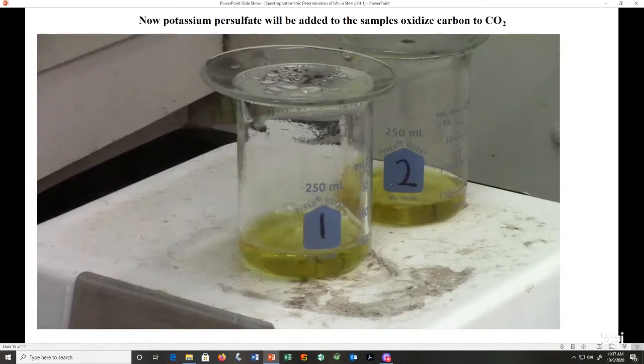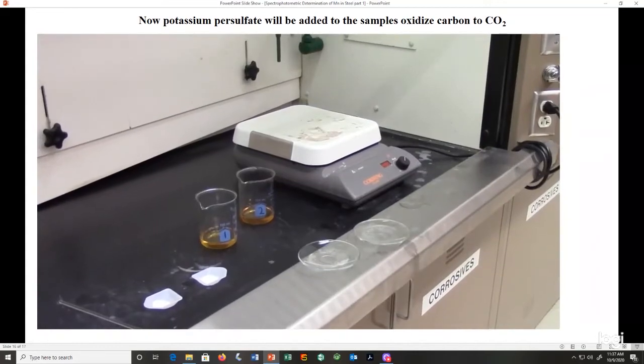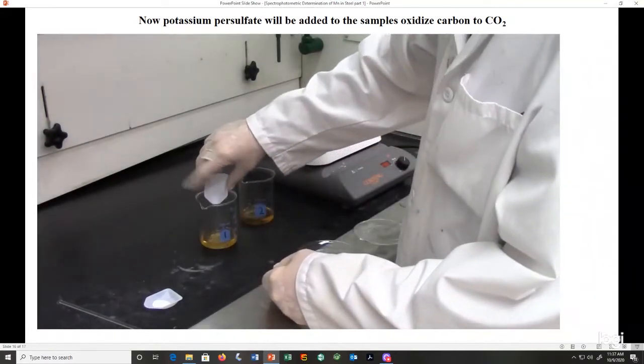Now potassium persulfate will be added to the samples to oxidize carbon to carbon dioxide. So here we have our boiling unknowns. We're going to take those off the heat, let them cool down for a little bit, and then we're going to add our potassium persulfate to each unknown and put them back on the hot plate.